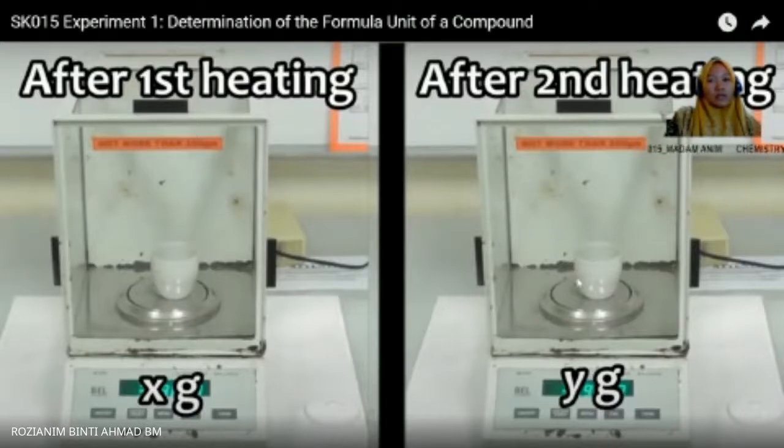So bila dia totally dry, the second heating should give a value less than the first heating. Okay, tapi sampai bila this process of heating and weighing should occur according to repetition, procedure number 8, 9 dan 10. Yang ramai tertinggal, you must find out the difference between the data from the first and second heating, which should be less than 0.02 gram.